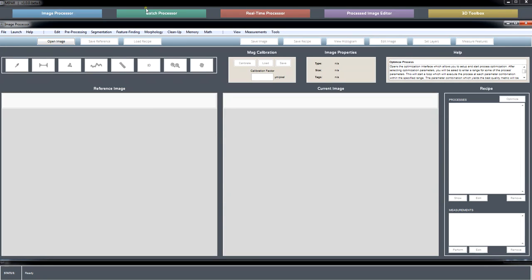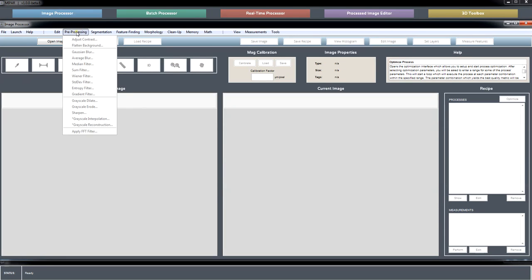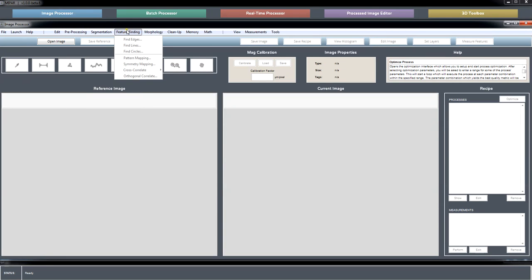And in the other two apps where the help box is featured, the purple and the yellow, those help texts are getting finished up, and I hope to have not only all of the help boxes fully functional, but each of the GUIs for setting up parameters, all of the UI elements in those will have tooltip strings attached. So when you hover over one of the sliders or one of the boxes, it'll tell you a little bit about what that parameter does. I hope that helps.